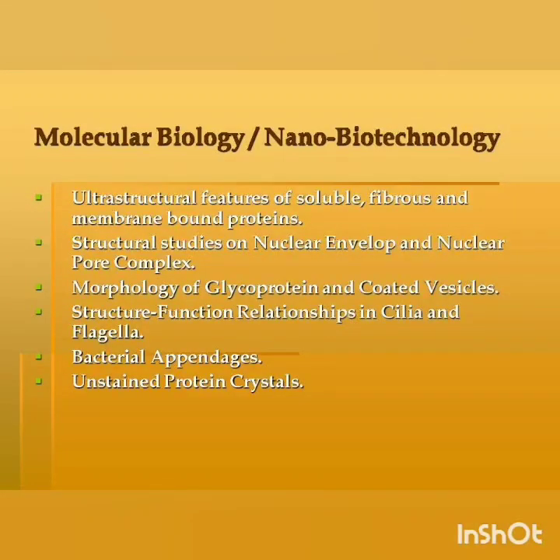In molecular biology and nanobiotechnology also, electron microscopy finds its wide application. Ultrastructural features of soluble, fibrous and membrane-bound proteins can be studied with electron microscopy. Structural studies on nuclear envelope and nuclear pore complex can be done.